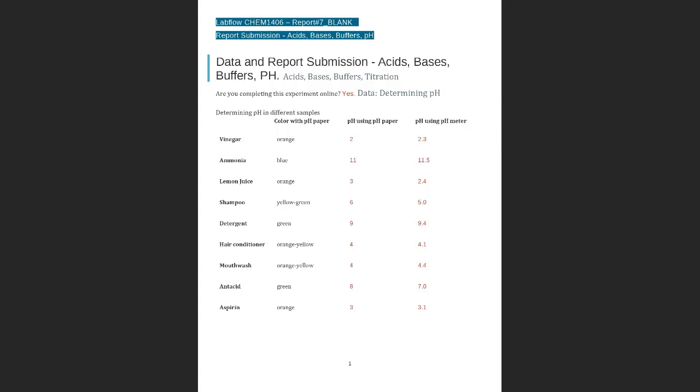they are using 2 different ways to measure the pH. They are using a pH paper, which is a paper that has different colors depending on the pH. And then they check the color of the paper with a scale, and it says pH of the solution.